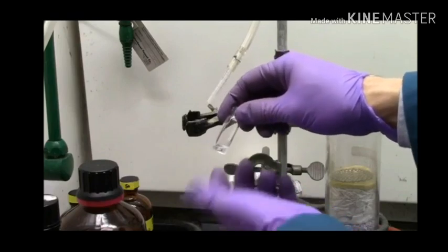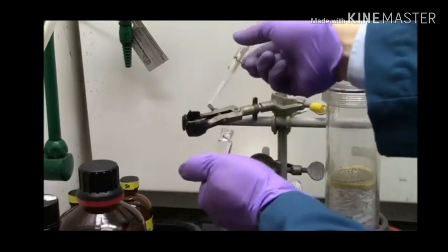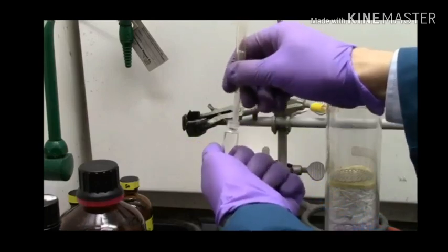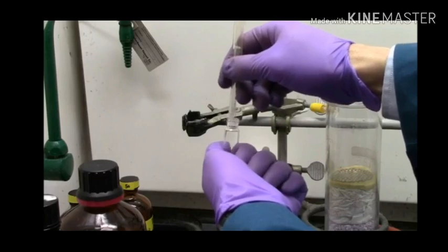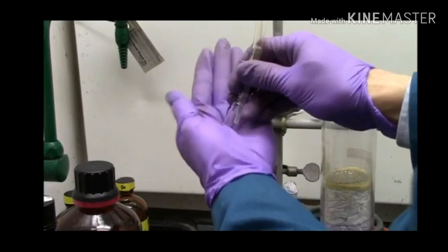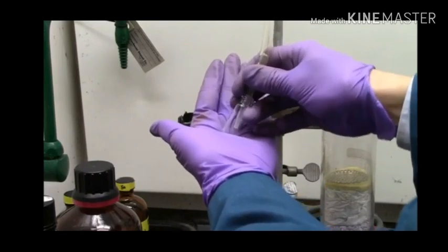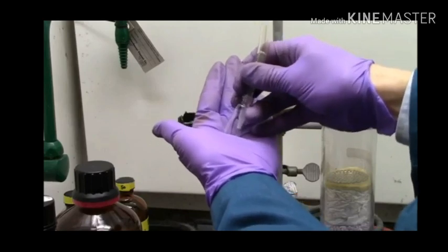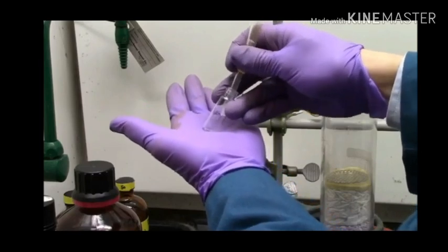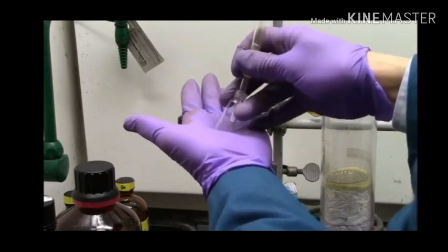To evaporate more rapidly, I'll use the heat of my hand to warm up the solvent while I am blowing nitrogen onto it. A little agitation can help increase the evaporation rate. It's very cold. Through the glove, I can feel the cold. While I do this, I should have the hood fan on. I have it off so you can hear me better, but when you evaporate solvents in the hood, the fan should be on. Sometimes at the end, it can be hard to evaporate the last drops. As the solute concentration increases, the boiling point is elevated.